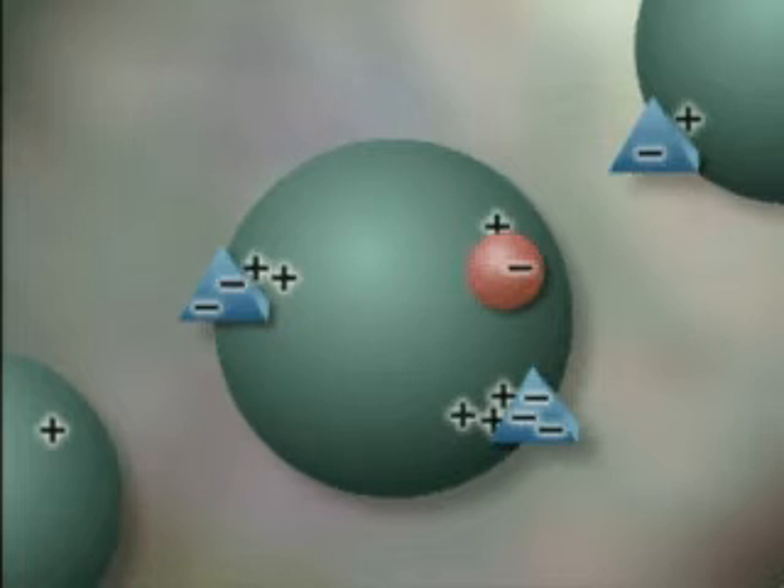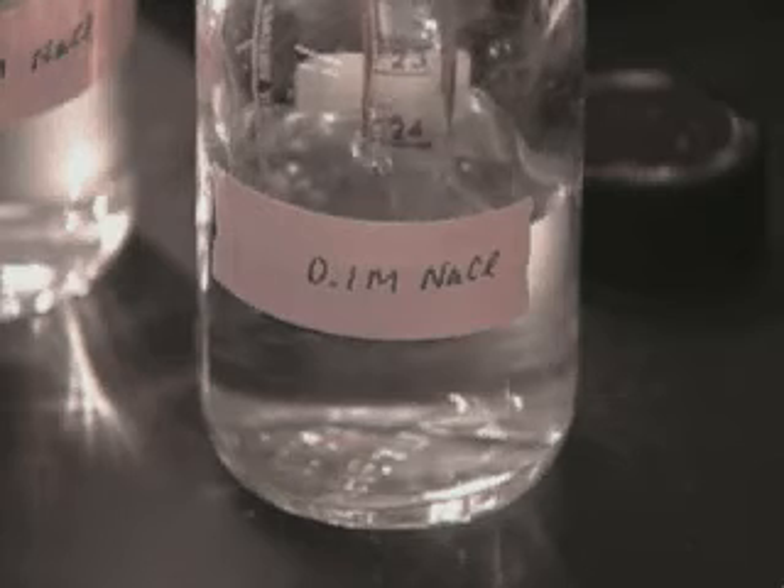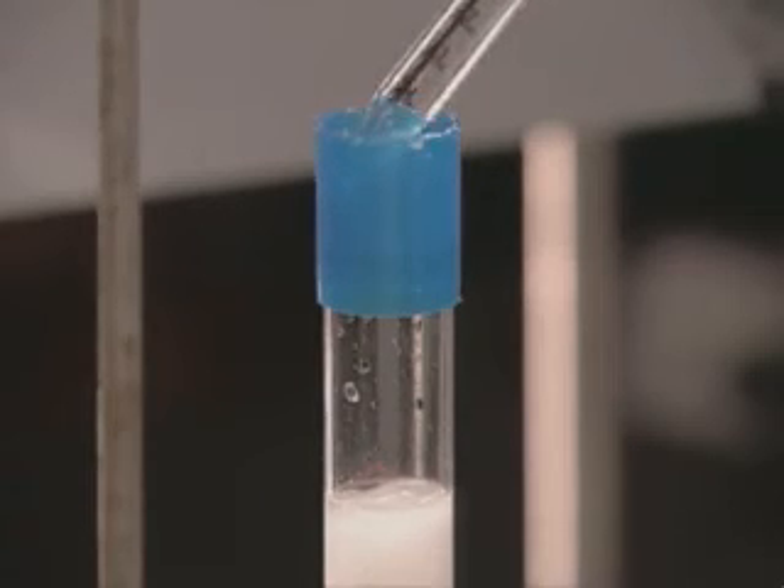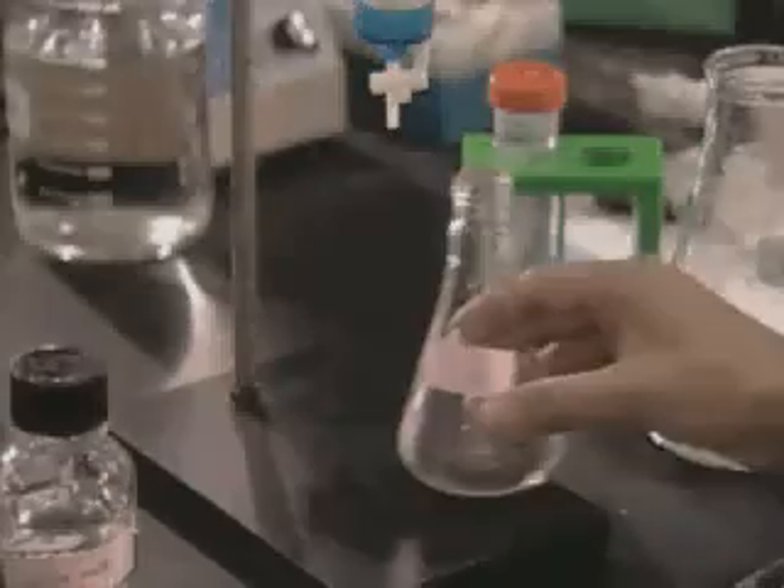Next, we want to sort the proteins that remain in the column by difference in charge. This is accomplished by adding increasing concentrations of positive and negative ions to the column in the form of salt.